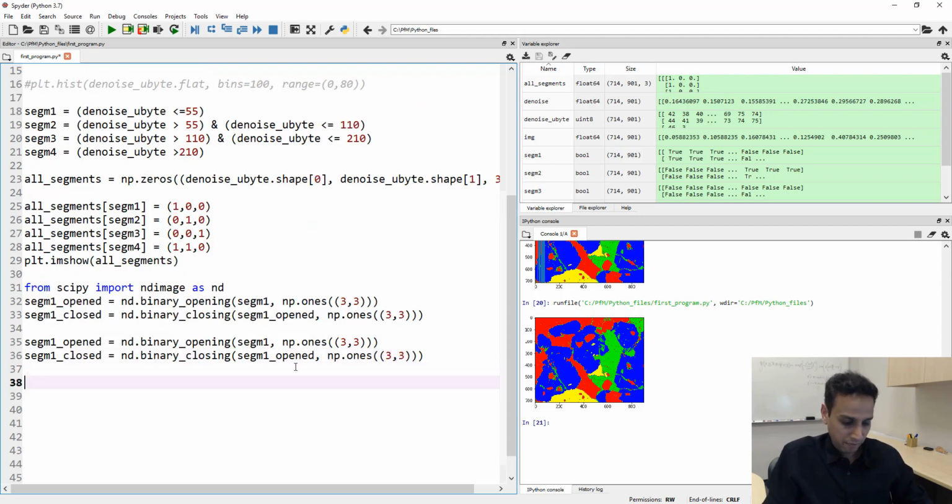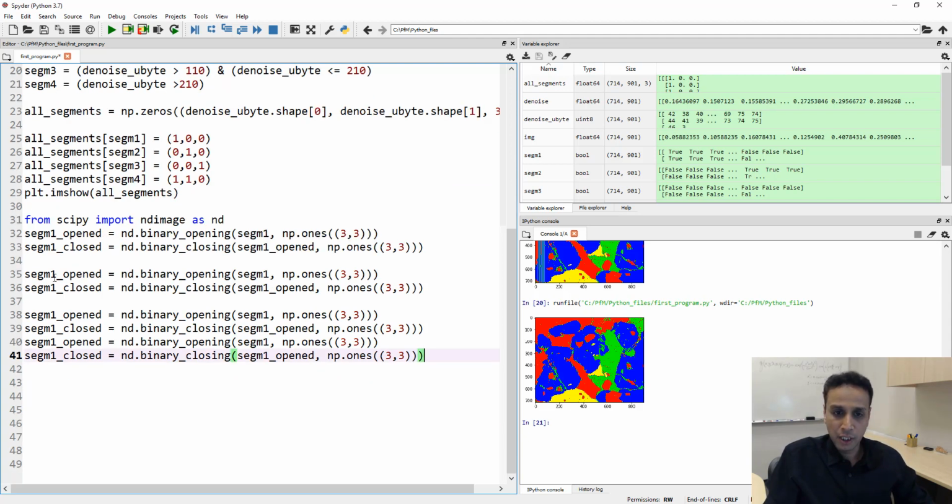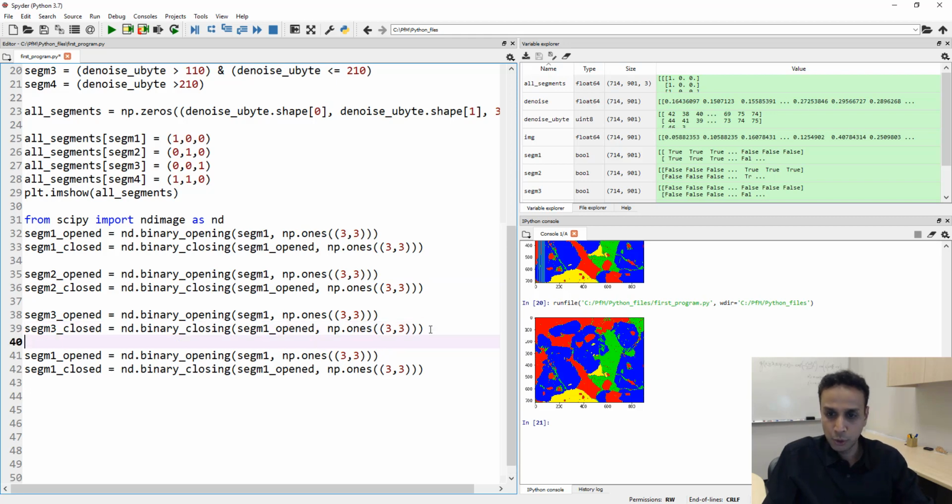And let's, okay, and this would be, again, same exercise, 2, 2, 3, 3, and I do not like that, so let's change it, and let's change this to 2, 2, 3, 3, 4, 4, and let's also do this here, segment 1, 4.